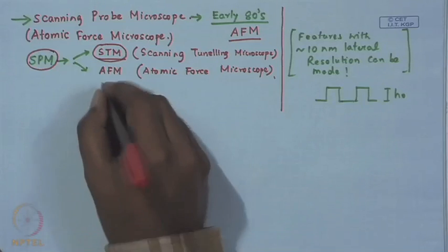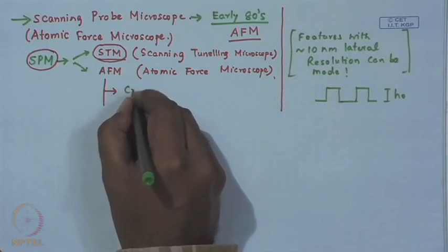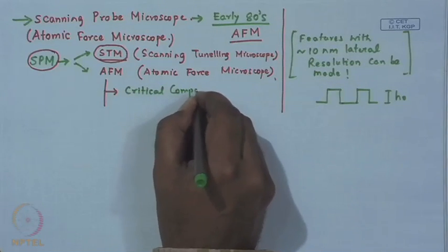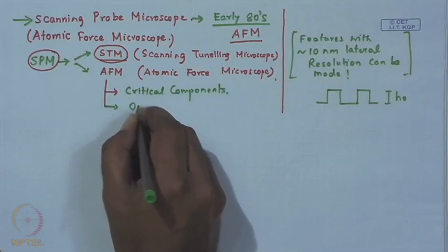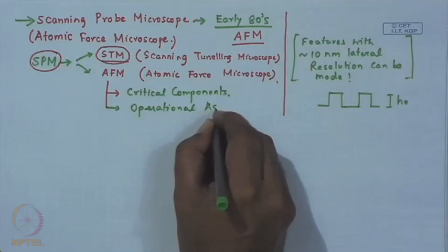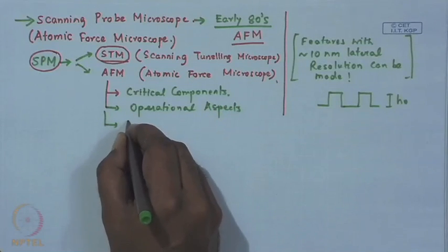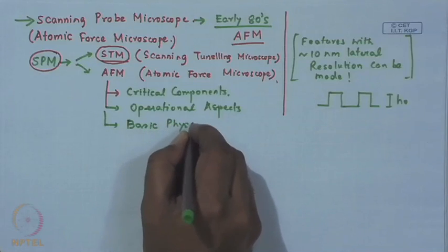So, we are going to talk about the critical components and some operational aspects, as well as the basic physics, which is extremely fascinating.